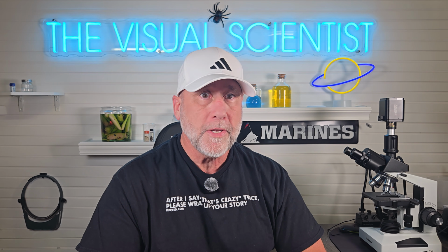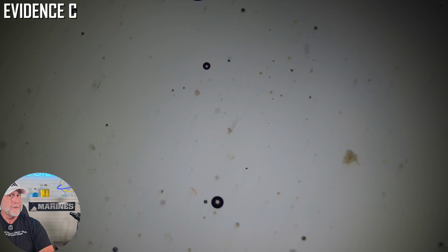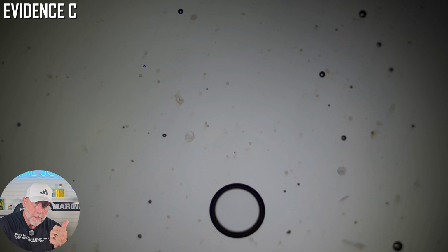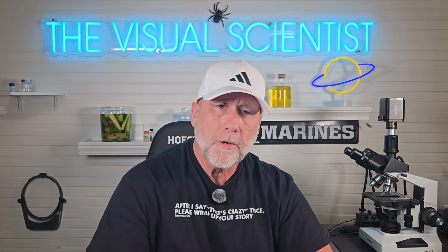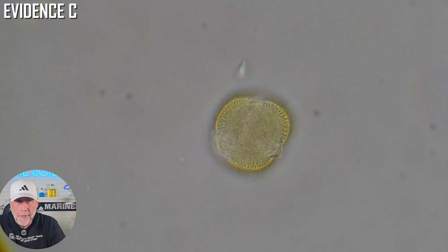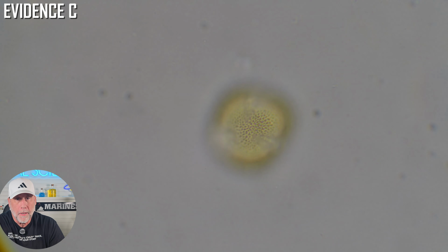Moving to evidence C. Evidence C, last one, 40 times. Okay, immediately this one is different. Even at 40 times, there's visible texture in this fluid. It looks heavier, cloudier, more going on inside at just a glance. 100 times. There's a lot of material in this sample. Non-uniform, irregular. It does not look like evidence A or evidence B at all.